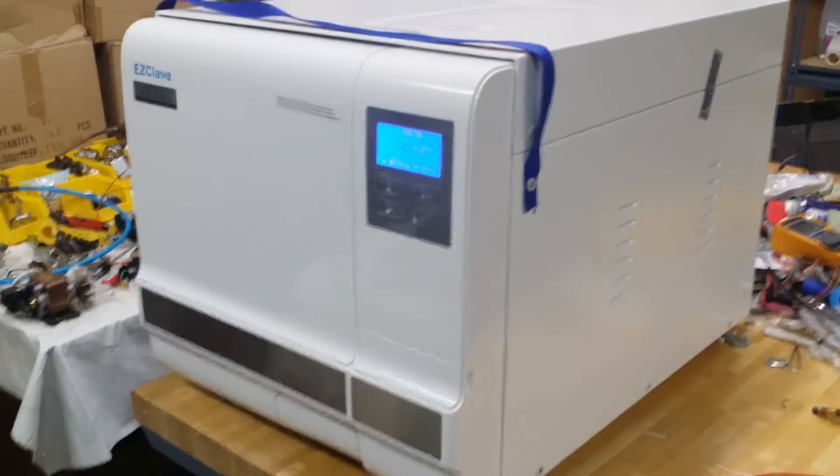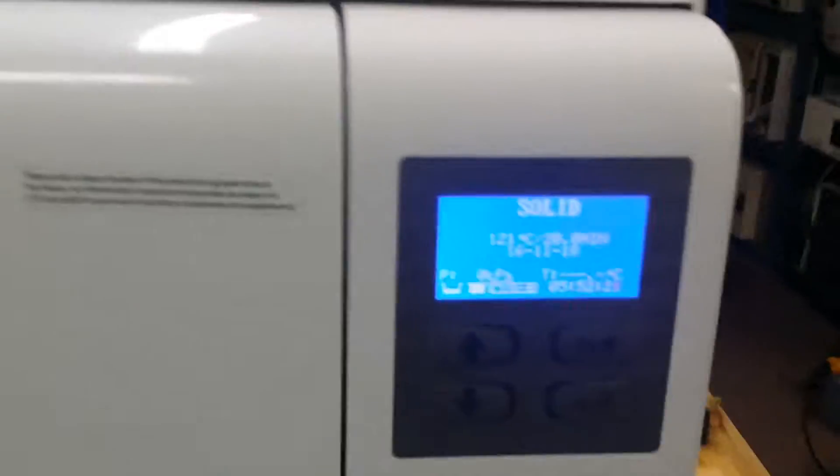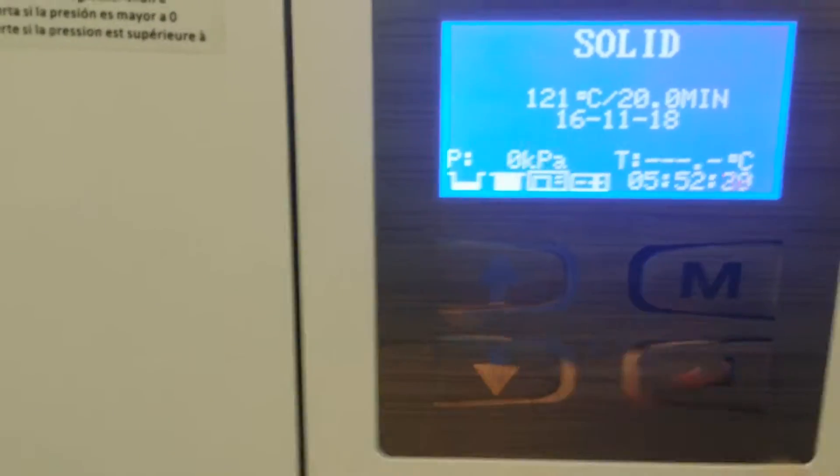It's a digital sterilizer and very easy to use. On the control panel there are only four buttons — one, two, three, four. Most of the time you just need to push one button to start the cycle.